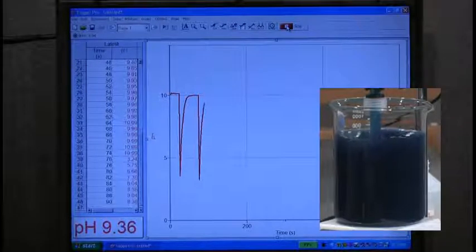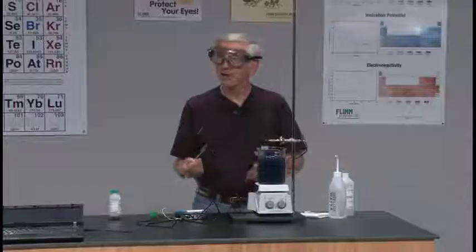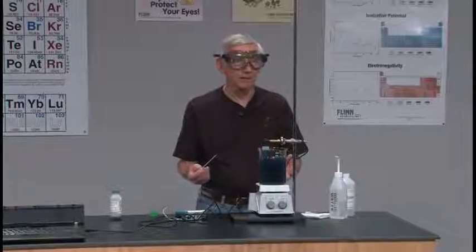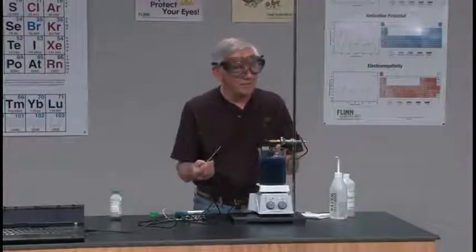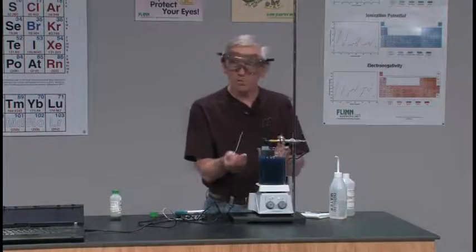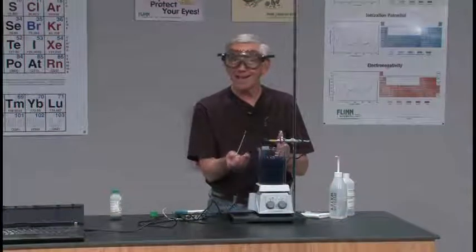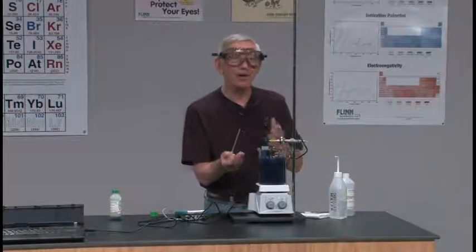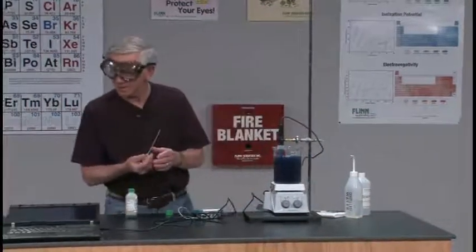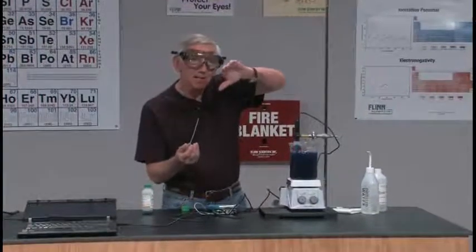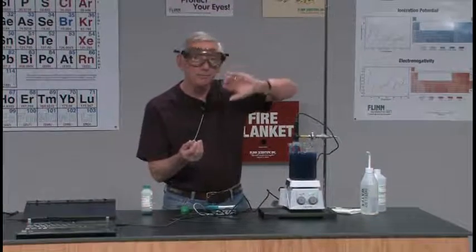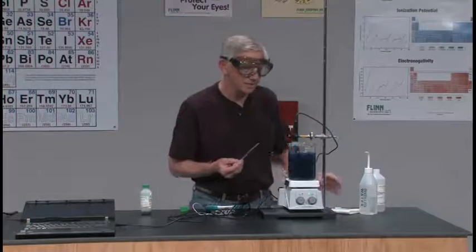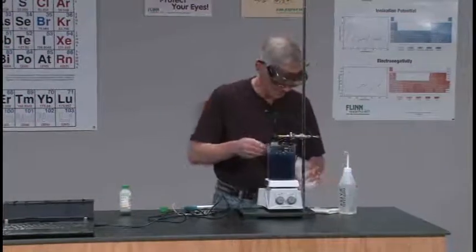You know, we joke about these things when we say, when you have a reaction like this, on a molecular level, this is fascinating. If you think about it, the fact that we've got this pH probe here is kind of letting us see what is happening on a molecular level. As that pH curve goes back up, we can interpret that the magnesium hydroxide is redissolving. Let's do a couple more.